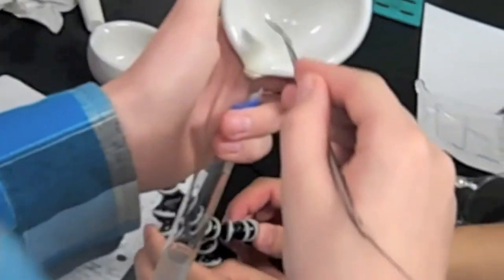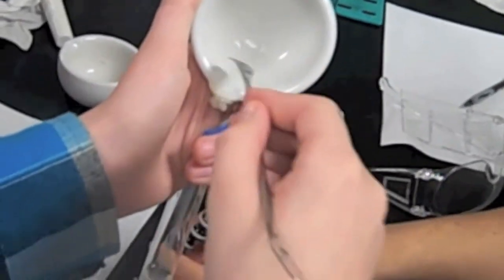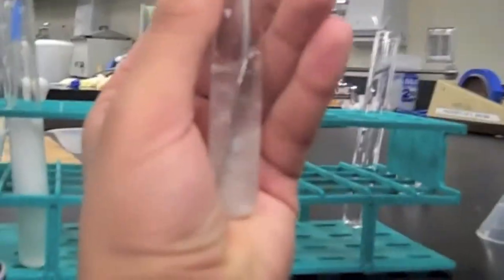First, the water is being measured. The potato was ground in the mortar by the pestle. The potato was transferred into the test tube with the water in it. The pH was controlled by adding acid. The reaction is started and mixed. And the height of bubbles is measured.